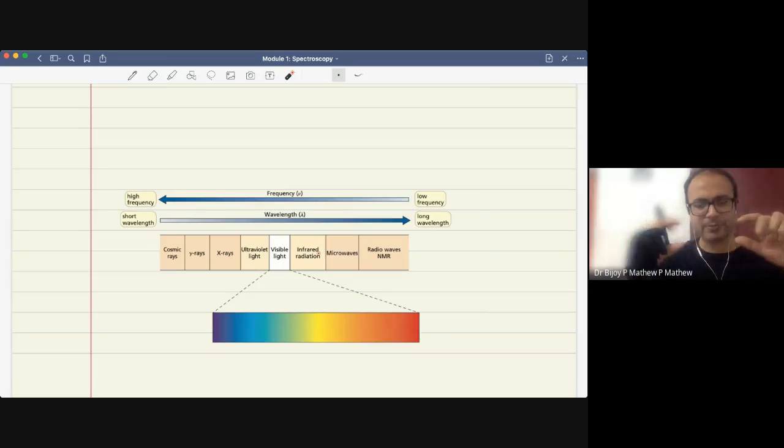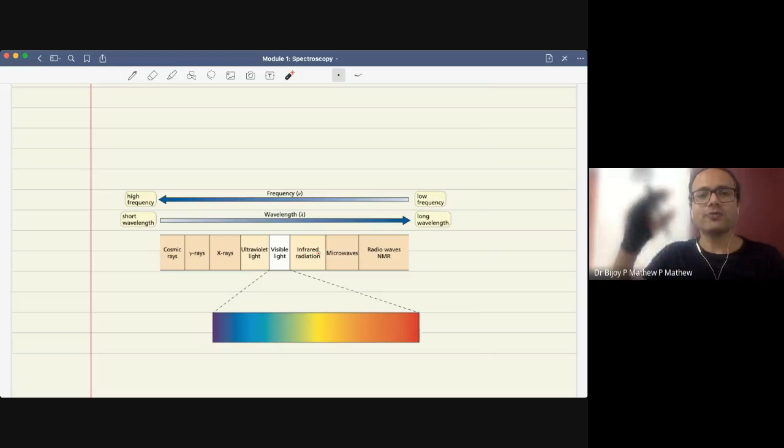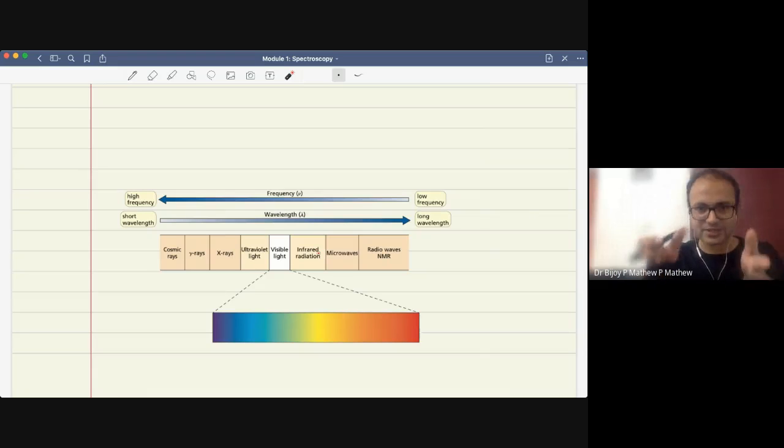So they have a particular bond strength or a bond frequency with which these molecules are usually undergoing a stretching motion. Okay, so when the infrared rays are incident upon this particular HCl molecule, one of the frequencies of the infrared will match exactly with the frequency with which this diatomic molecule is undergoing these stretching vibrations. When that frequency matches, it will absorb that particular frequency of the infrared region. So it will cause a peak in the infrared spectrum.